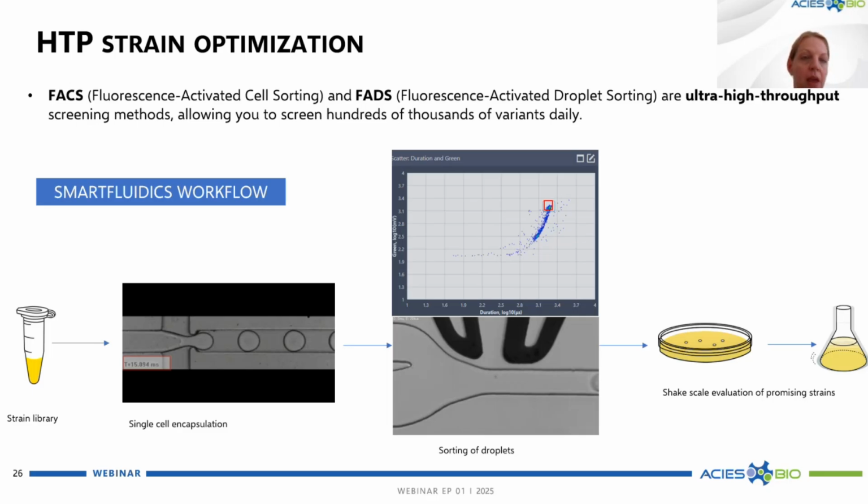But we also developed our own smart fluidics workflow, based on fluorescence activated droplet sorting, which means it can also be used for bacterial cells and extracellular products.